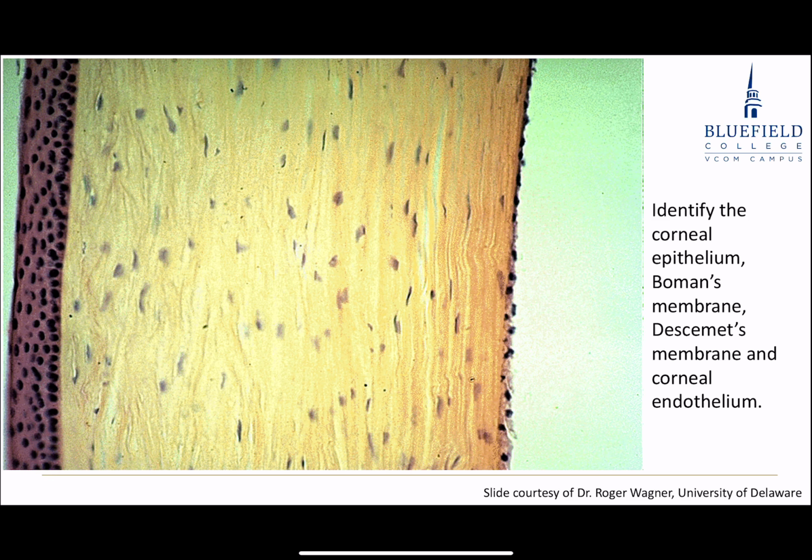This image is not high resolution, it's pixelated a great deal, but there'd be a Descemet's membrane right here, and Bowman's membrane here, just deep to this epithelium. Doesn't show up that well, will not show up in every slide well, but when it does show up, it shows up vividly.